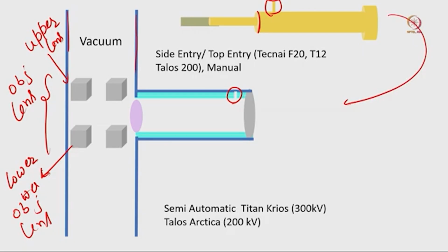So, this is the holder, and there is no grid at the beginning. Now we are adding that grid. So now the grid is added here. Now this entire setup, this entire holder, will move from here and go towards the goniometer.